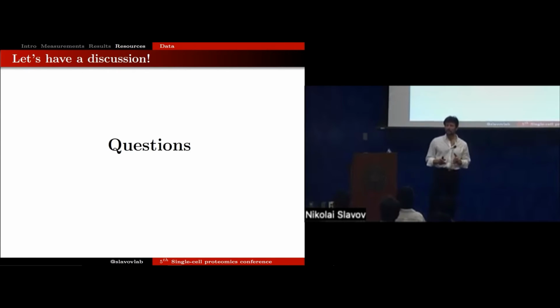Yeah, so this also depends on the method, how that is being designed, because we can have a data acquisition method with DIA, where we spend most of the time on MS1 scans, or we can spend in another kind of method most of the time on MS2 scans. So in the first case, the MS1 data will be better. In the second case, the MS2 data are going to be more quantitative, just because of how much we acquired, what is the temporal resolution.